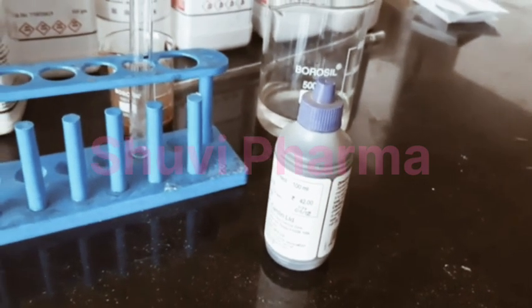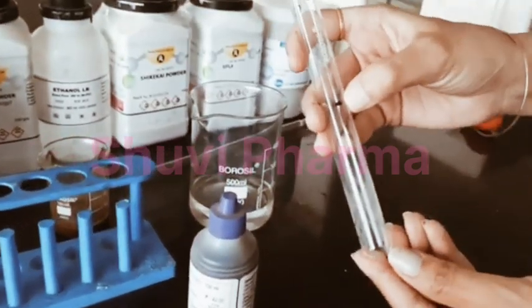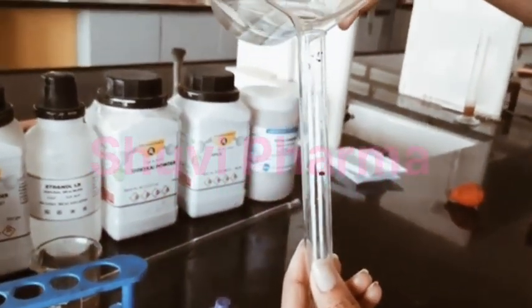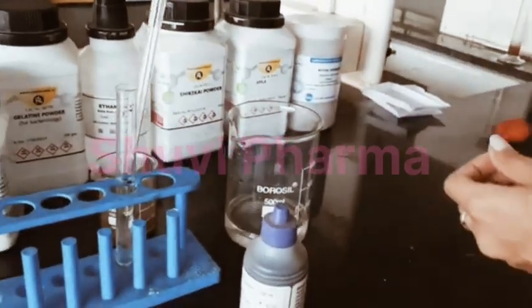So now we will perform the dirt dispersion test, that is for evaluation of shampoo. So for that we require a test tube, okay, which is marked up to 10 ml. So we will take 10 ml of distilled water in the test tube. To this we will add 2 drops of shampoo.